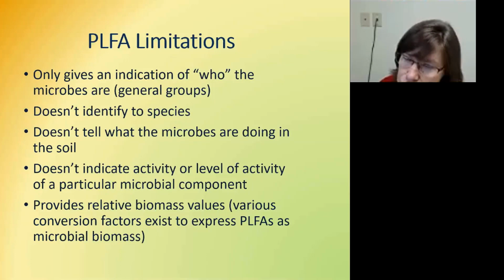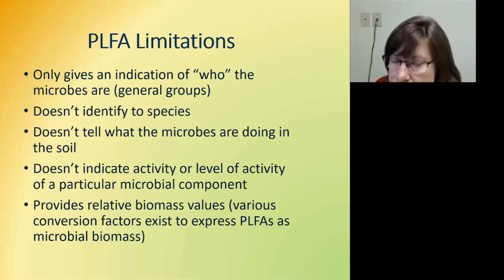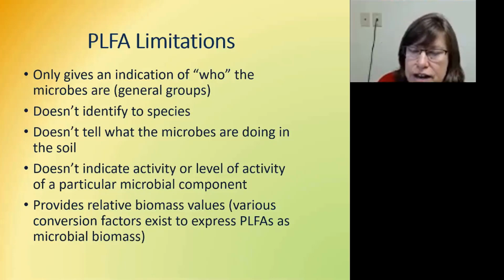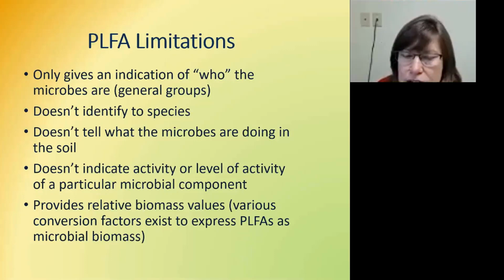And while it might be instructive to look at these, I wouldn't use this for statistical analysis, because I'm sure each species probably has a different ratio of biomass per PLFA picomoles. And what you would be doing would be introducing error. I hope you understand that. If you need me to, I'll try to explain that a little better.